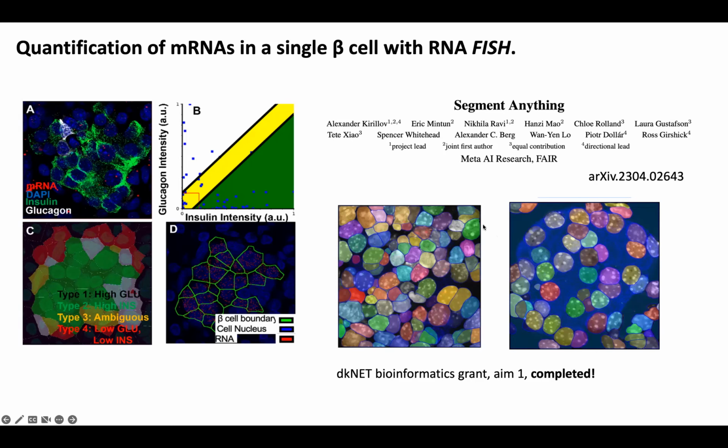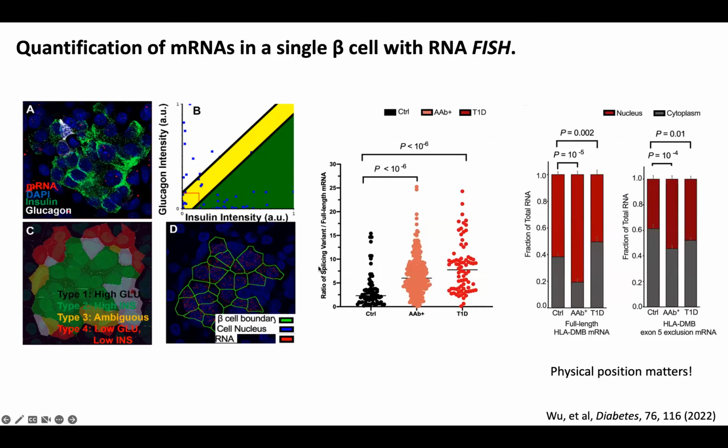We have some other technical issues that we are trying to solve in the M1. For example, we want to identify technical issues when you are trying to register your slides from one FISH image to another, for example, the proteomic images. So there's always a technical issue. And with this approach, we got some interesting results, finding out that the expression level of these RNAs inside the nucleus or inside the cytoplasm is quite different.